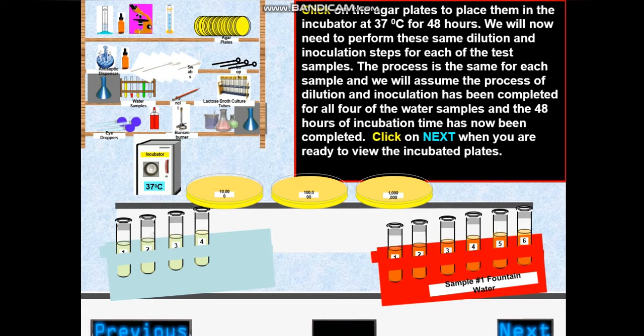We will now need to perform the same dilution and inoculation steps for each of the test samples. The process is the same for each sample, and we will assume the process of dilution and inoculation has been completed for all 4 of the water samples, and then 48 hours of incubation time has now been completed.